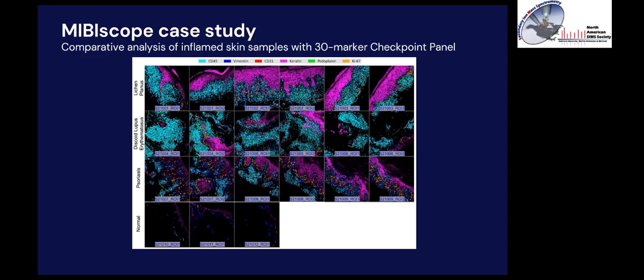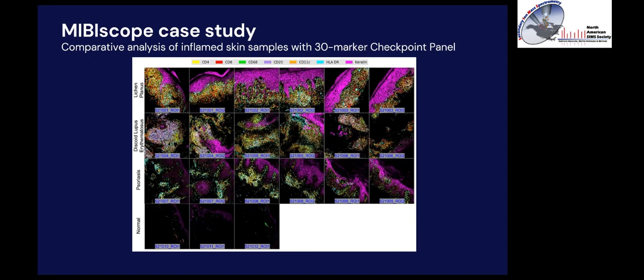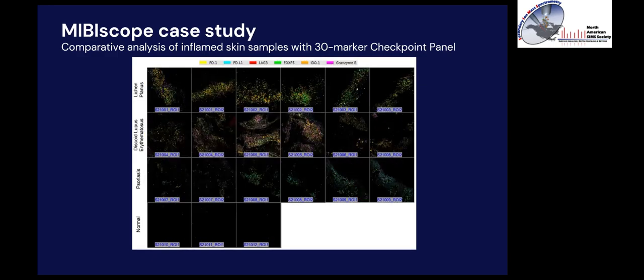Anyone that has been doing multiplexed imaging, or even SIMS imaging, of a number of different species of interest knows that you can't really look at 40 different things in one image. There just aren't enough different colors for that. So this shows you, as we drill down into even further subsets of immune cells present within these samples, that there's a lot of qualitative data in there already just by looking at the number of different markers that we have. And then we can drill down even further into some checkpoint markers that tell us the current state of those cells and whether they're actively fighting an infection.